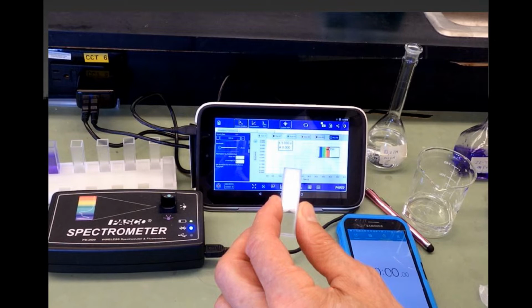First, you add the crystal violet solution, and you can take as much time as you need to do that, so you can deliver the required volume with a Mohr pipette or a serological pipette, any graduated pipette. But then the sodium hydroxide is added second, and it needs to be added quickly, because as soon as it's added, the reaction begins, so you don't want to be waiting for the pipette to drain the sodium hydroxide.